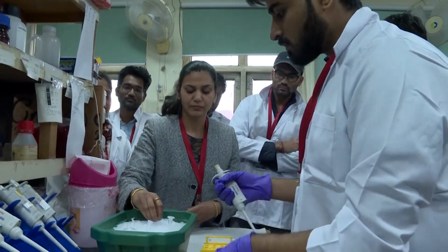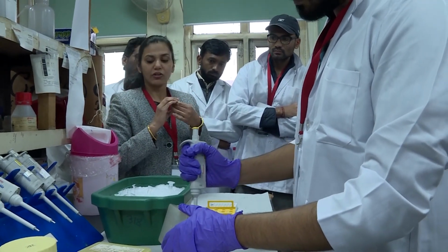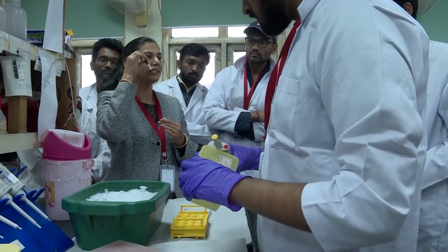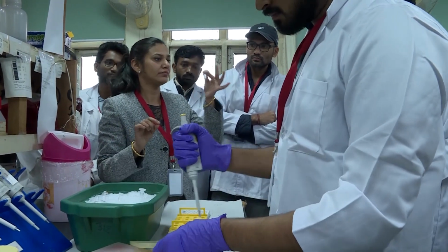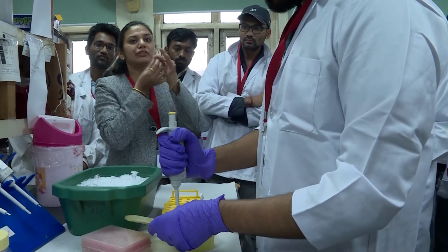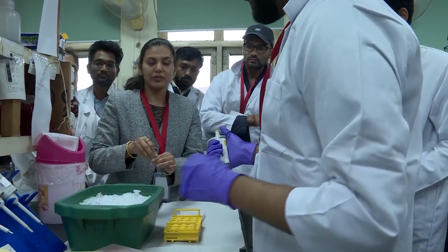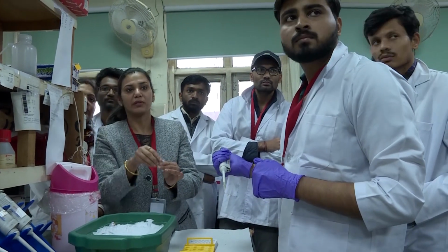This is SYBR. Since SYBR is a light sensitive thing, the tube which the company provides it in is a brown, dark colored tube. If we are transferring it into a transparent tube, it should be covered, otherwise the reaction will be affected by light. Please switch off the light.